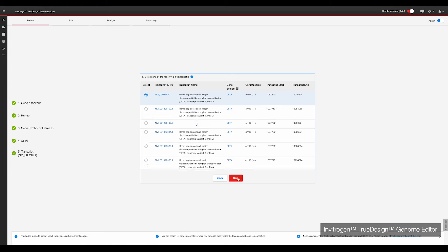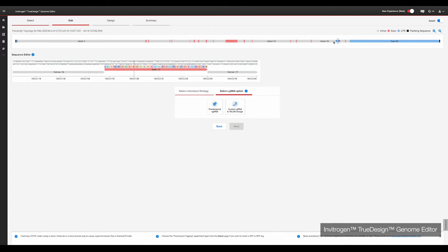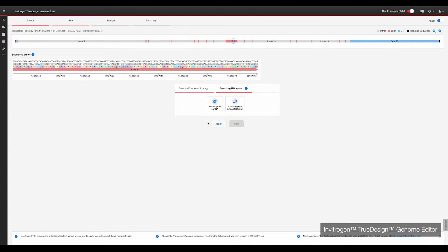Next, pick the transcript of the gene you wish to target. You then need to select the type of knockout edit you wish to perform. Today we will use frameshift indels. TrueDesign gives you the option to use pre-designed gRNAs that will target the first exon of a gene, or custom gRNAs that require you to use the gene navigator to select the specific nucleotide site you wish to target. Today we'll choose pre-designed synthetic gRNAs.